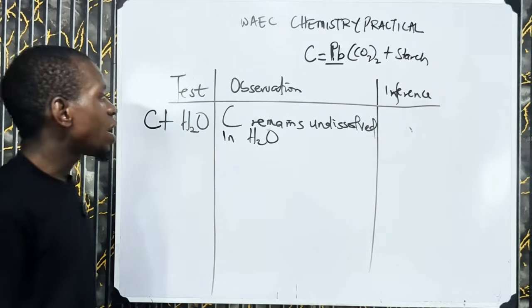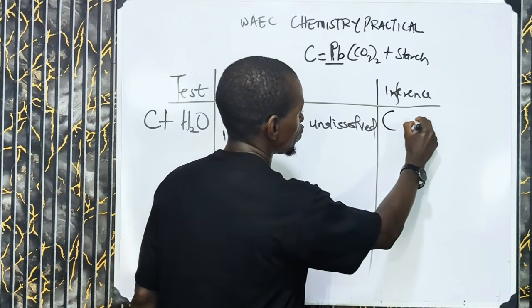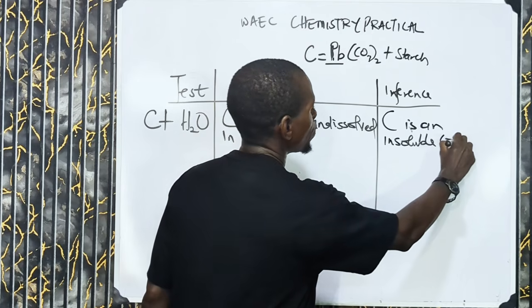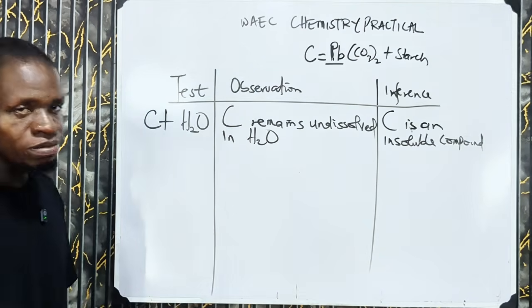That is okay. And that simply means that sample C is what? An insoluble what now? Compound. So it's just an insoluble compound.